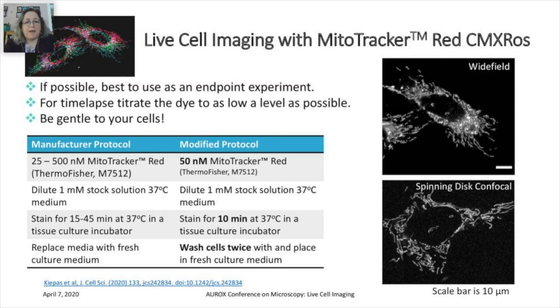So for example, I have here on the left the manufacturer's protocol for MitoTracker Red, and then on the right the modified protocol. So we were able to use one of the lowest concentrations they recommend for the MitoTracker Red dye in this situation. We reduced our incubation time to just 10 minutes, which is a little bit outside the recommended range. And we also wash the cells afterwards to make sure we get rid of any free dye in the media before placing it back in the media. And with these conditions, we've been able to image cells for several hours without any obvious toxicity due to the dye itself.